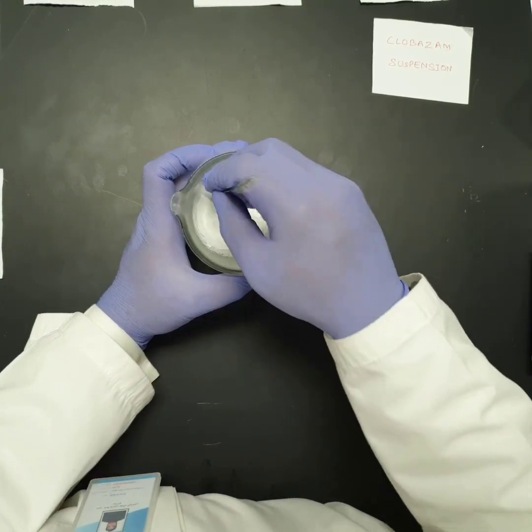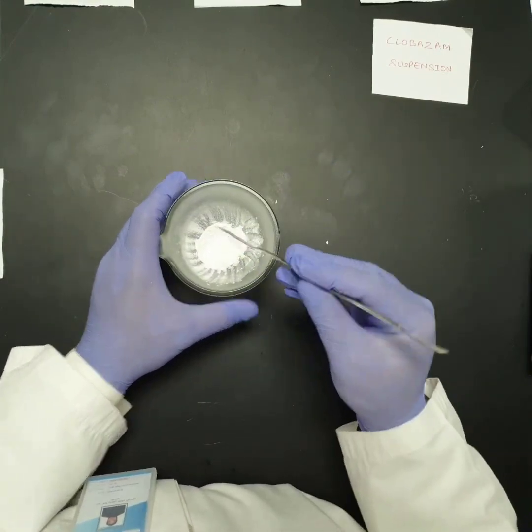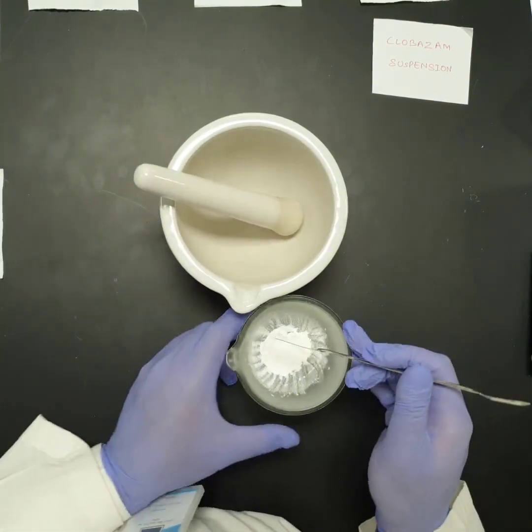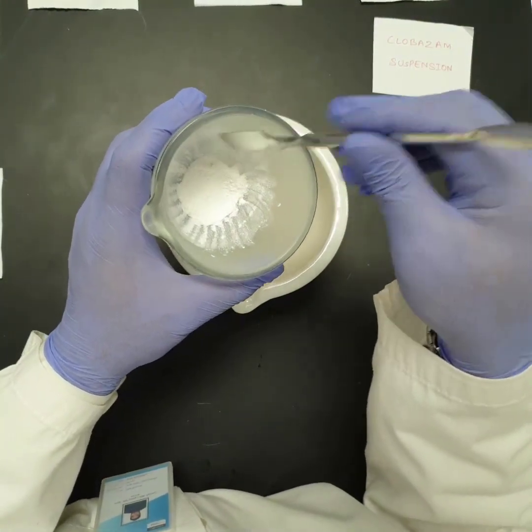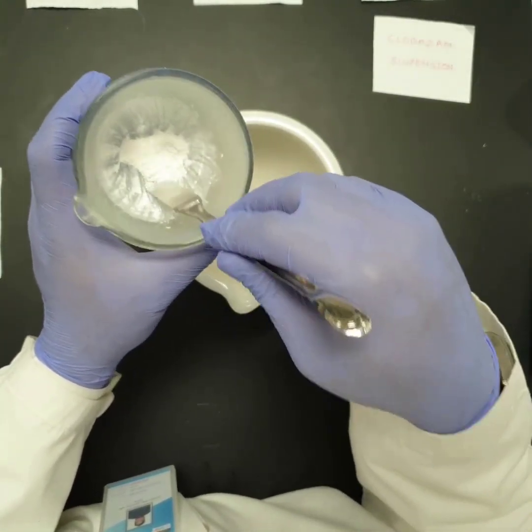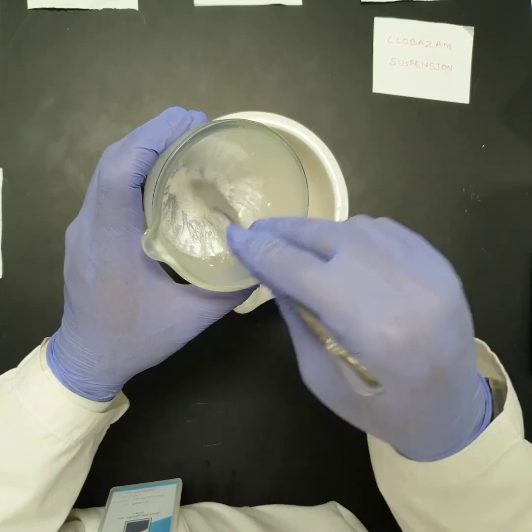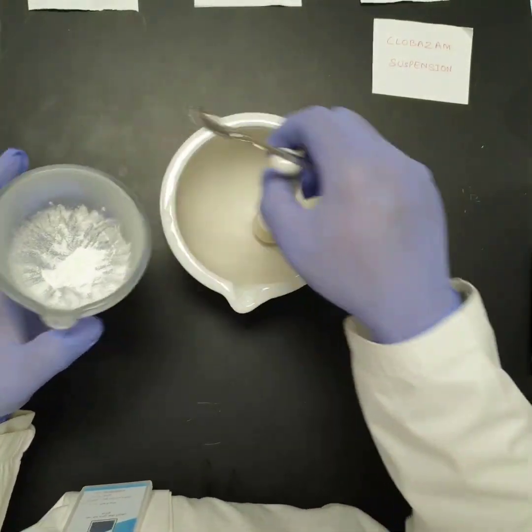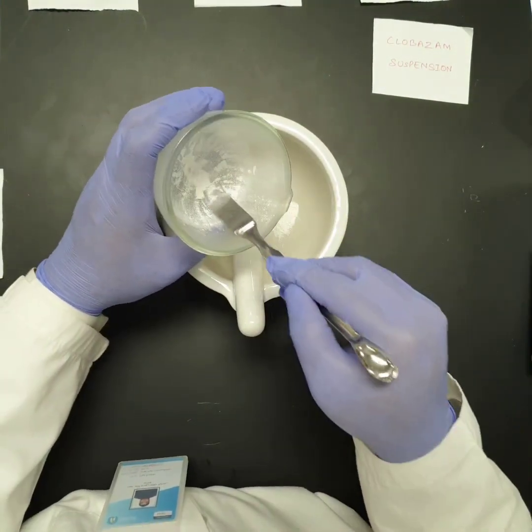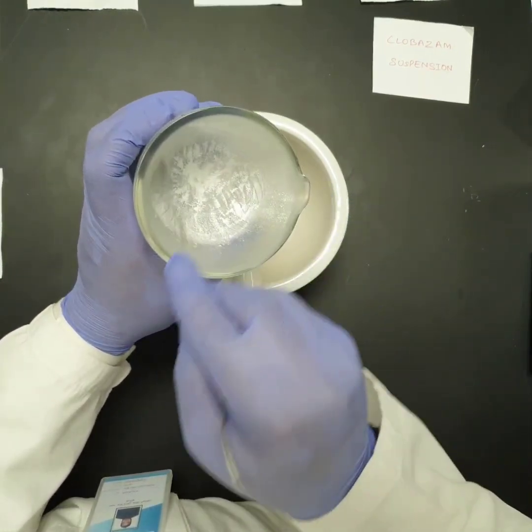So now it's time for the second step, which is to take a porcelain mortar. I'm going to transfer the contents, which is nothing but the crushed tablets, 10 tablets of clobazam, now in fine and smooth powder, to the porcelain mortar. So it's transferred now. So I will remove anything which is stuck to the walls of the glass mortar.